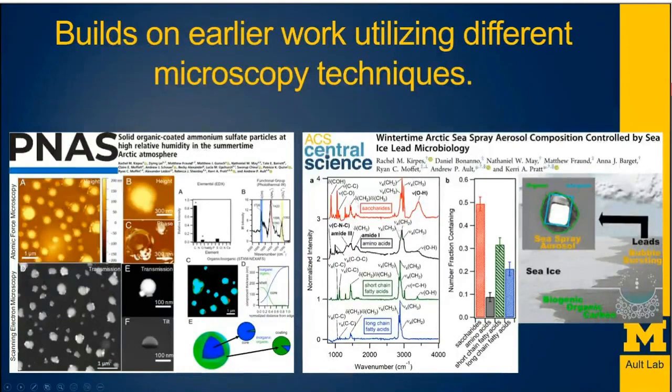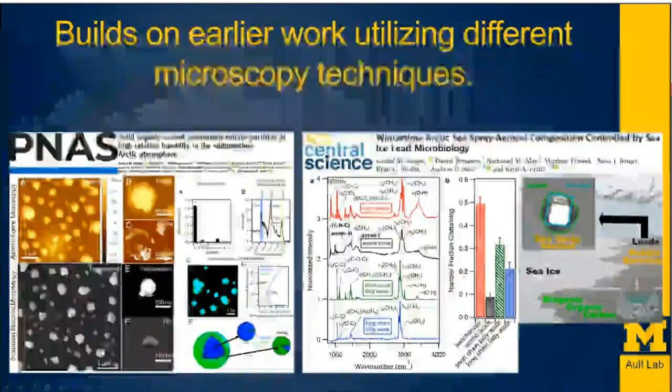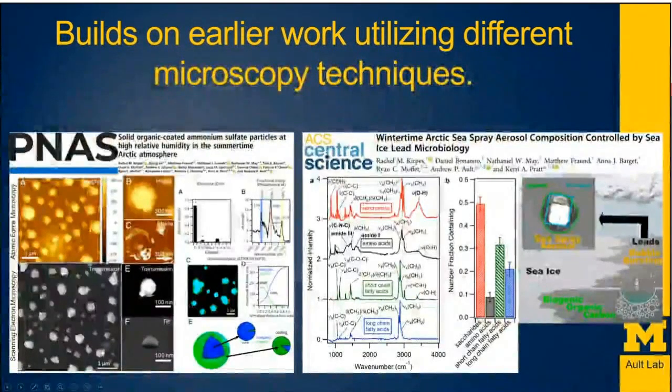And so you can see categories such as saccharides, amino acids, short-chain fatty acids, long-chain fatty acids for these particles, where you can see in the electron micrograph over here on the right, a salt particle and then organic content kind of looping around it that had dried on that substrate. And this actually built on some really nice work by Rich Cochran and Vicki Grassian at the University of California, San Diego, the chi-squared analysis we did for these different categories of organic species.